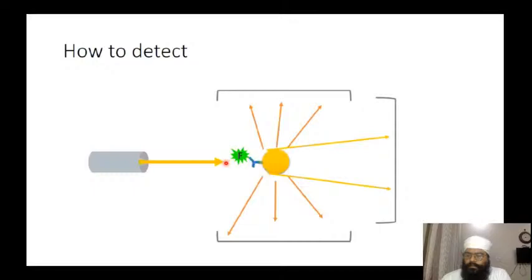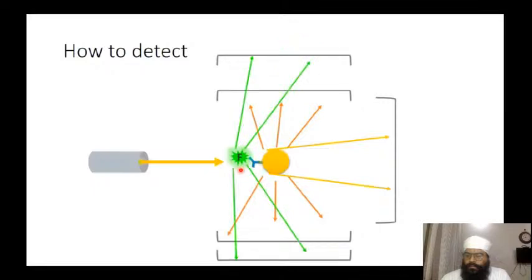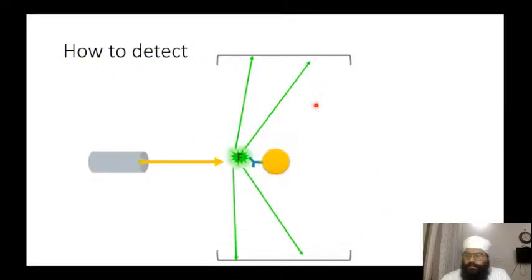And then when the fluorophore passes through the laser beam, the fluorophore will be excited. When the fluorophore is excited, it will emit light at a particular wavelength, and this light will be detected by the fluorophore detectors. All these detectors are connected to the computer, which is going to give me the exact data about every event of these three.